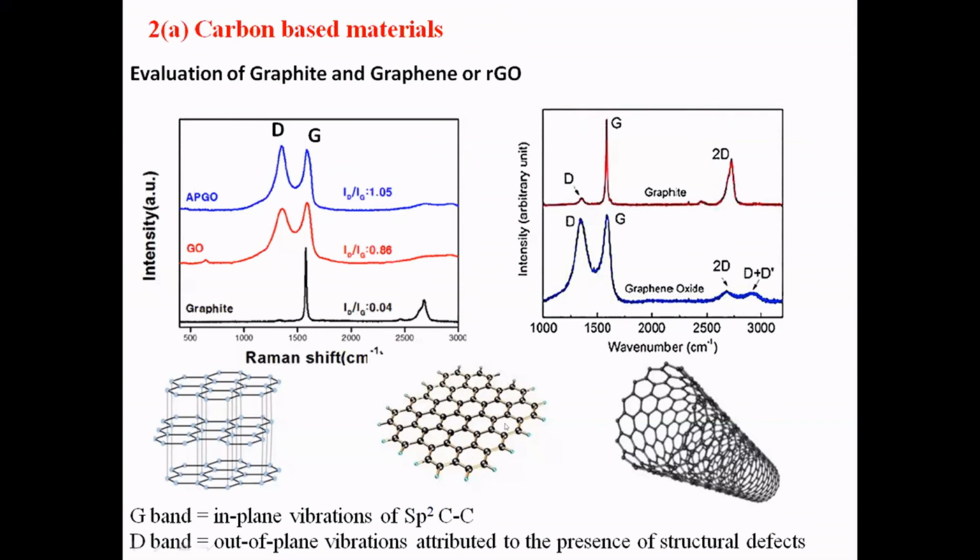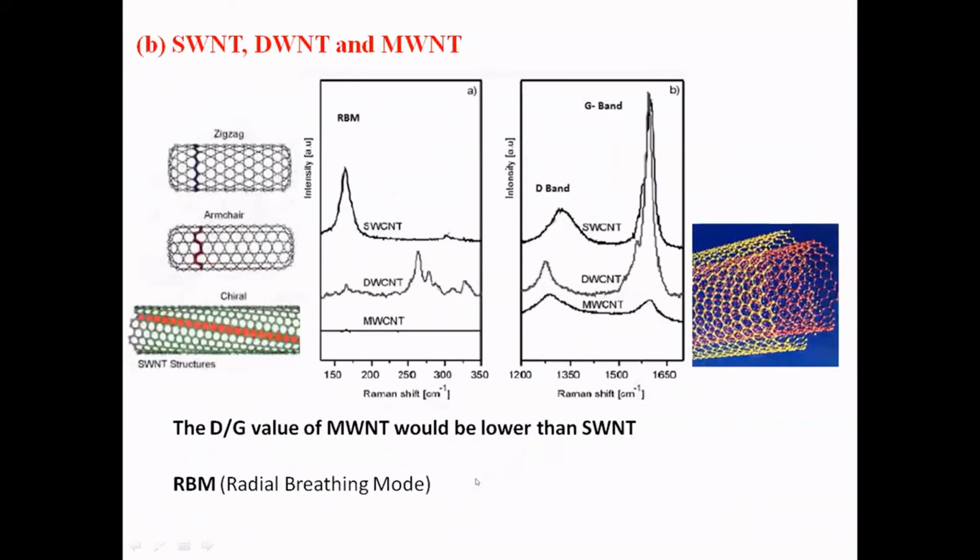And of course, what I'm saying is that different structural changes happen with the tubes, and you see the spectrum. So how can Raman help you in differentiating the multi-wall carbon nanotube and the single wall carbon nanotube? It's all related to the bandwidth and the intensity. So it is directly related, and you can do all the secondary level analysis by taking the numbers, not by simply looking at the shape. So you do the calculation, and you will be able to tell.